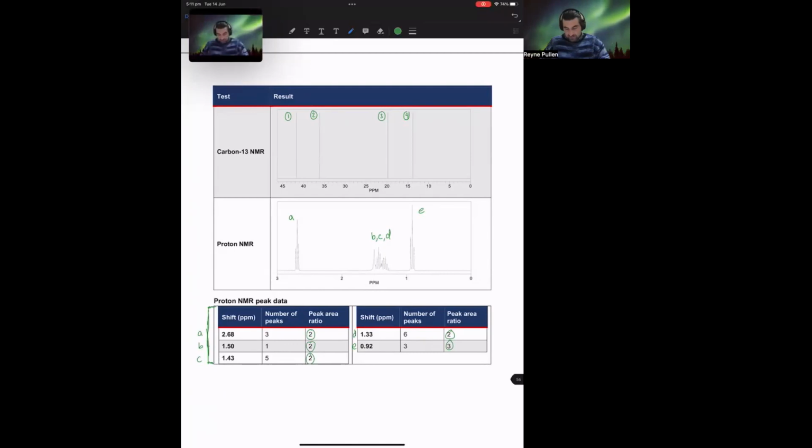But the fact that we only have 1 3, what does that mean? It means that maybe we have a mirrored structure. Maybe that terminal carbon, there are 2 of them and they just happen to be the same. Or perhaps we have something present that is not a carbon and is terminal in our structure. So that's something to start thinking about.